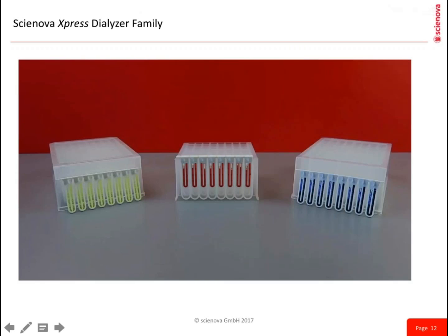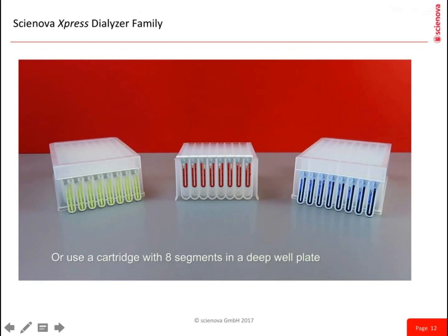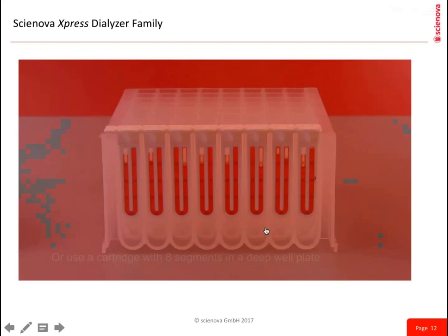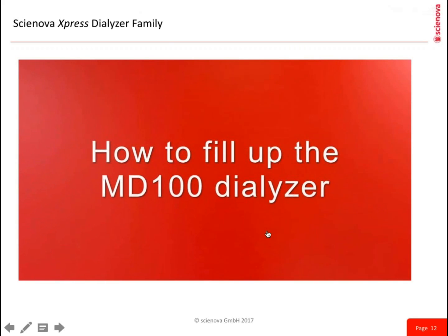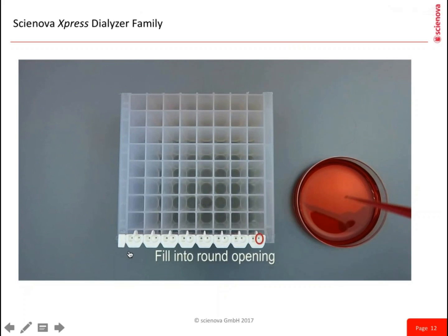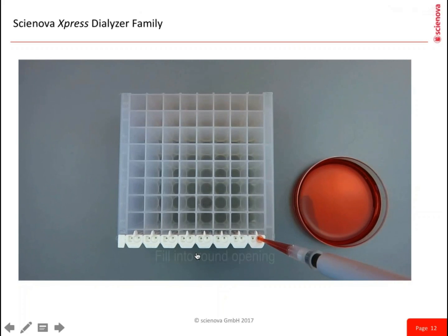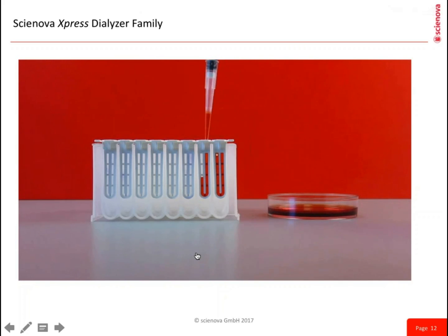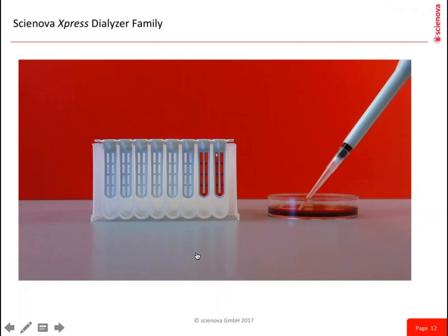Here you can see a cartridge of a microdialyzer MD100, and you can see from above 8 segments here, and you can load your sample with a standard laboratory pipet and can use the wide opening to fill in the sample.